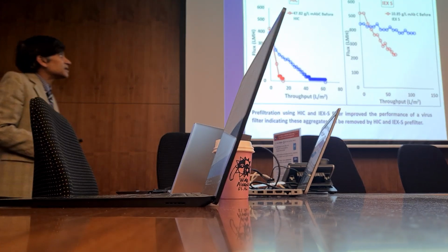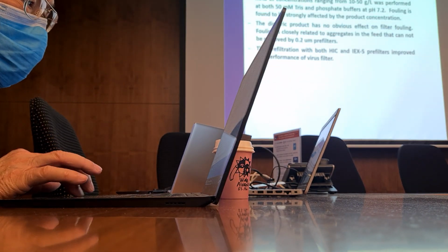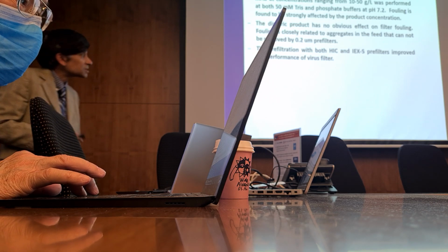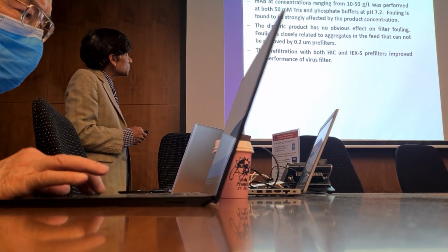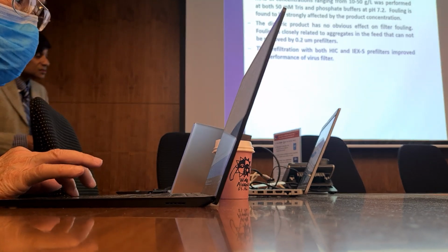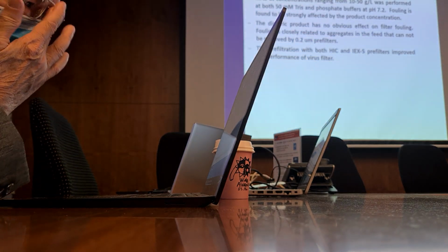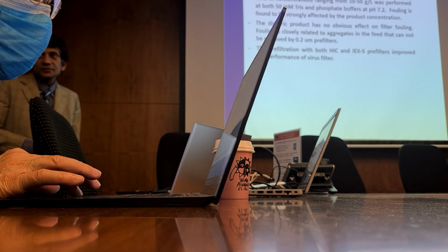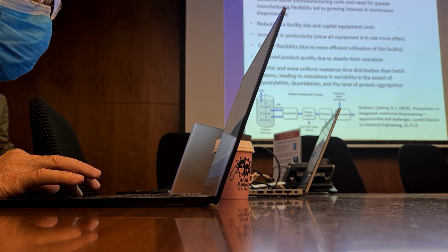So that's one of the challenges that one looks at in this area of current batch type processing, and there are others which we could talk about as well. But pre-filtration is an area that is quite important. There are many types of commercial pre-filters available based on ion exchange, hydrophobic interaction, and so forth. Okay. Let me move on. If you have questions, please stop me.